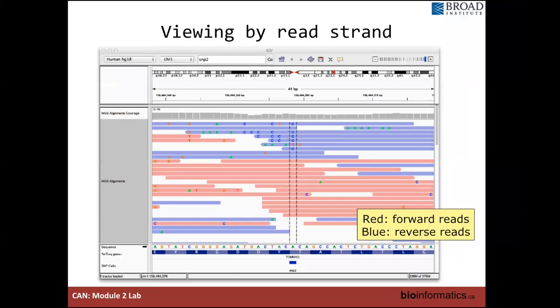Coloring the reads themselves can also help you identify artifacts and structural variants as well. So here the reads are no longer gray, but they are red and blue for forward and reverse orientation. So if you look at this position here, if these reads were gray, you would say, okay, that's pretty good indication that there's a single nucleotide variant here, but if you look at the orientation, the variant only occurs on the reverse reads. So it will kind of make you question the validity of this particular SNP, and you can maybe rule out certain false positives this way.